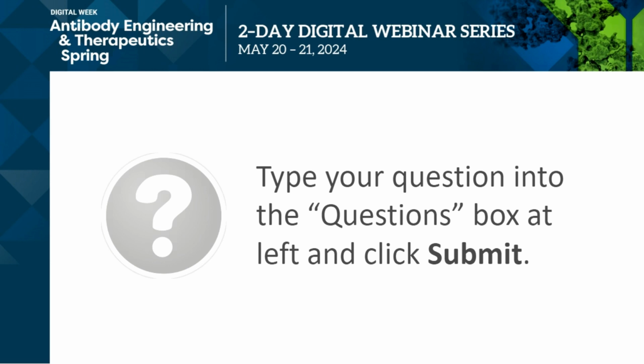Great, thank you. And I think we have time for another question. Are the nanobodies generated from the camel mouse of human origin? Is additional humanization necessary for further use in clinical settings? Yes. So as I mentioned, in the camel mouse, in this version, we use the mouse VH genes.